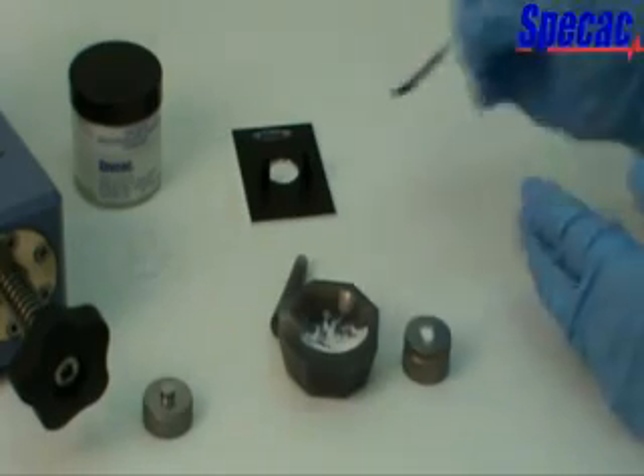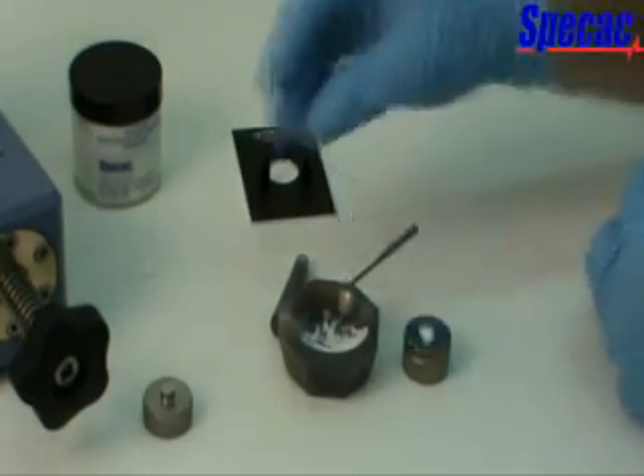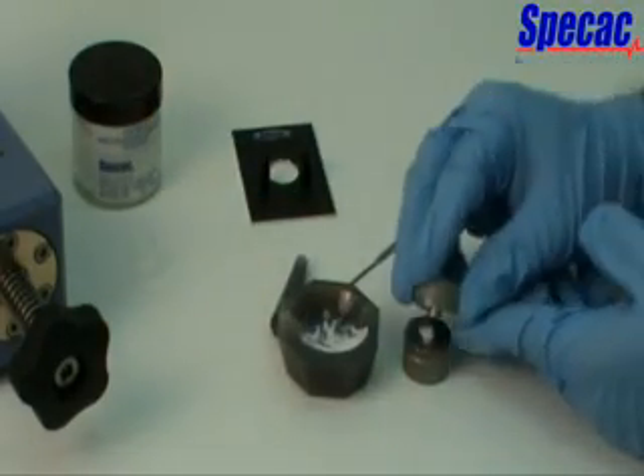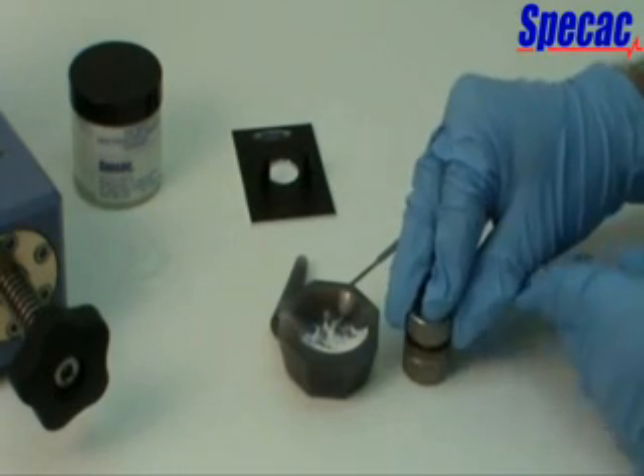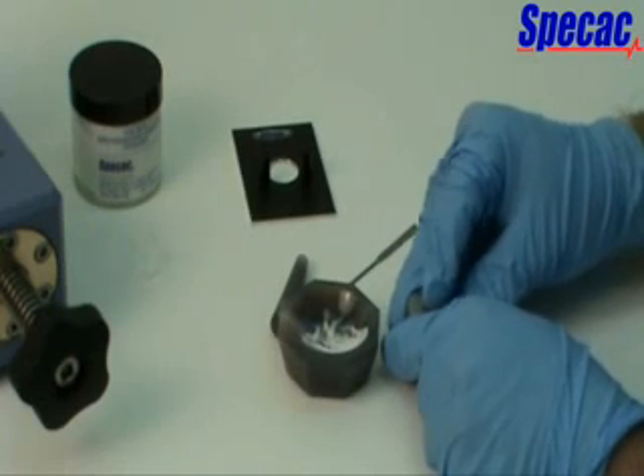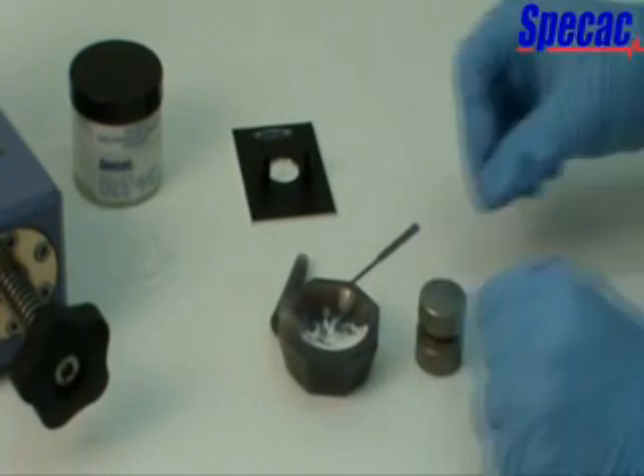Now take the top anvil with longer central plunger piece and place it carefully, plunger face downwards over the sample, die ring holder and bottom anvil assembly, into the central aperture hole. Use light pressure to compact the powder mixture into the hole.